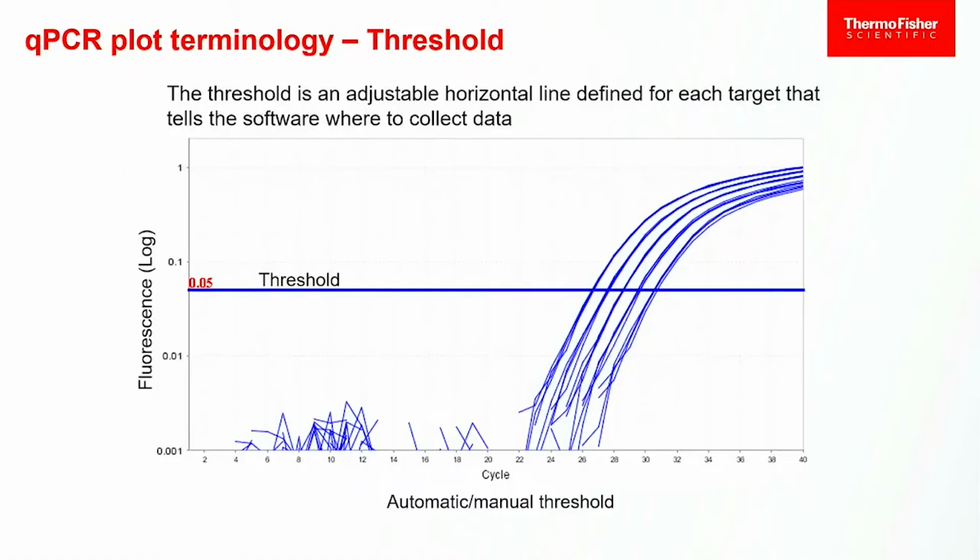It's a little counterintuitive to everything else that we measure in the lab, and why in our table it looks like the smaller number had more stuff, but the smaller number does have more stuff. That's how it's defined. And one of the mental hurdles we have to go through when we learn this technology is that everything we think we know is kind of turned upside down.